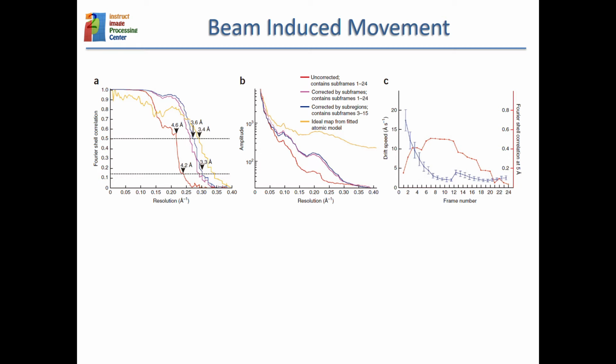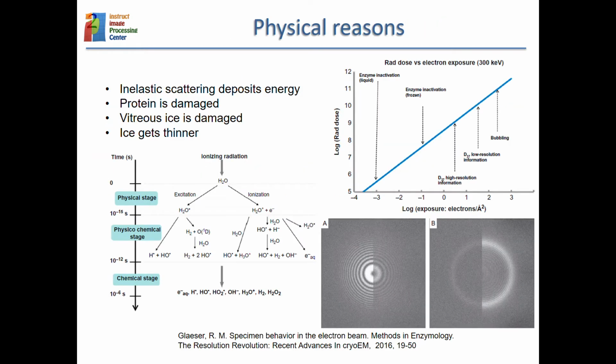Now I would say these weights of the different contribution of the frames are measured at the level of polishing. So once you know your structure, you compare your structure to the frames, and then you decide what is the radiation damage and what is the quality of each one of the frames, and then the higher the quality, the higher the weight will be. So there is no longer this need for choosing which frames should be used for the 3D reconstruction. And this paper, I like it a lot.